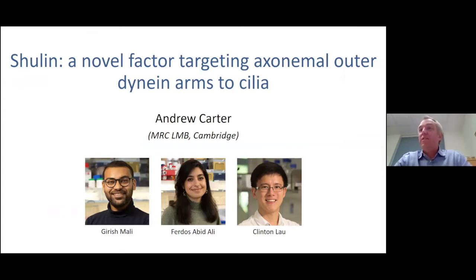Right, so what I'd like to do today is to tell you about a story that I think is one of the broadest that's come out of my lab. It spans all the way from identifying a novel protein, finding out what it does in delivering things to the cilia, to cryo-EM structures that find out how it works. And for today's meeting, perhaps the most relevant thing will be that it's some nice examples of how to use cryo-EM for looking at really quite flexible samples.